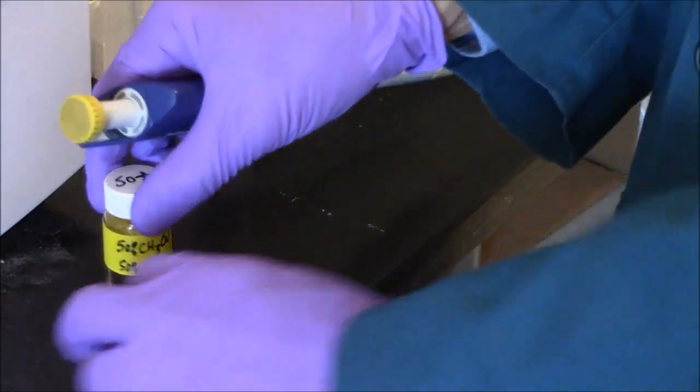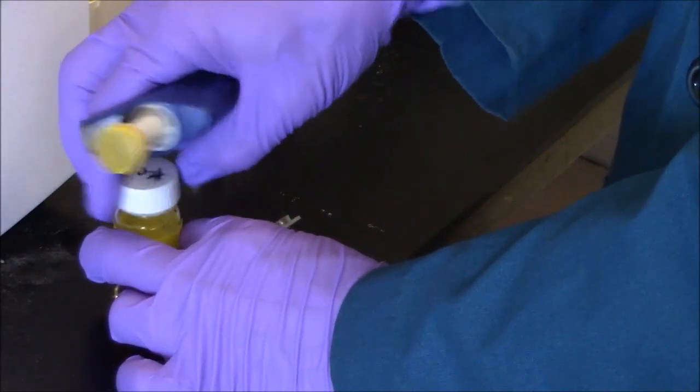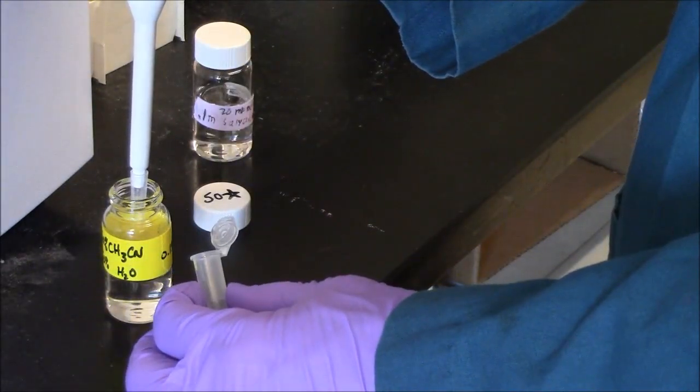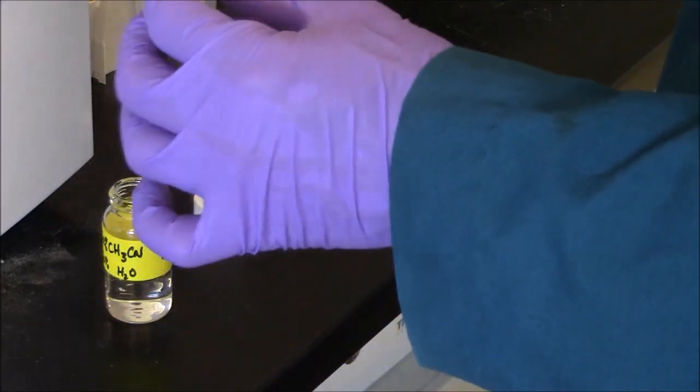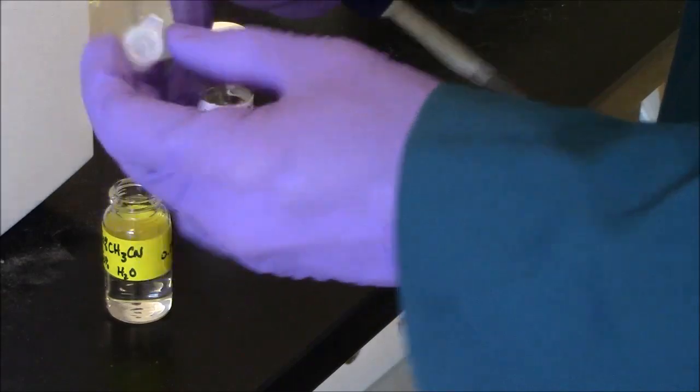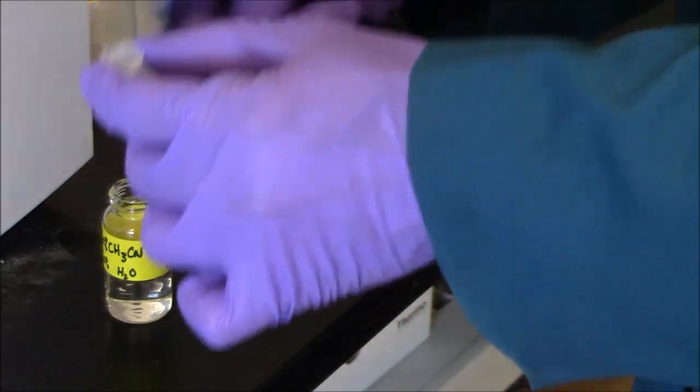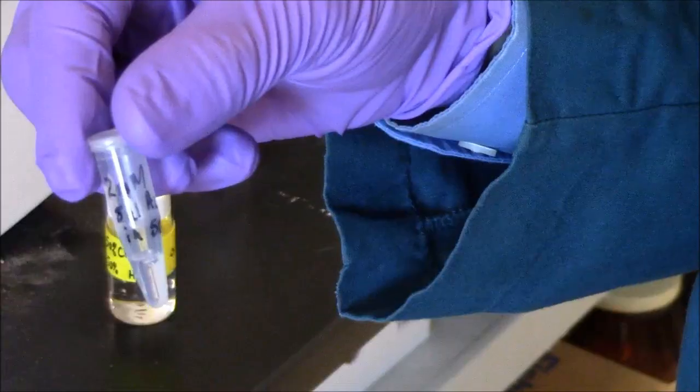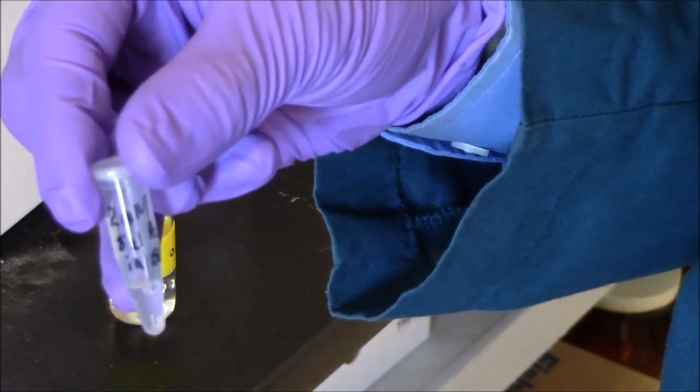So now I'll add 200 microliters of 50-star to my sample to dilute it appropriately for the HPLC. And I just agitate that gently. Here's my sample, ready for injection.